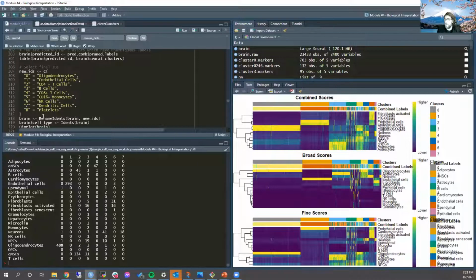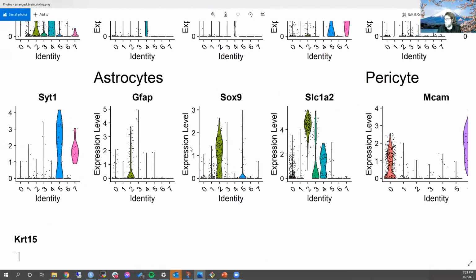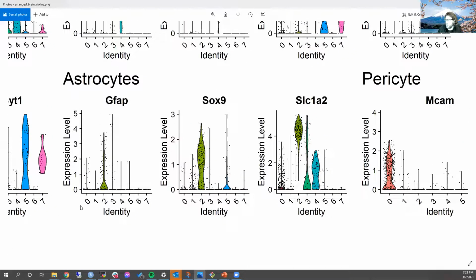Okay. All right, cluster 2. Now this one is less clear cut. We see astrocytes 45, QNSCs 134. Now this is where your background knowledge is honestly really important. So let's go back to our prior knowledge plots. Let's take a look at the astrocyte category here. We see our astrocyte markers are pretty strong in cluster 2, but there might be a little bit of ambiguity, at least in one of them.